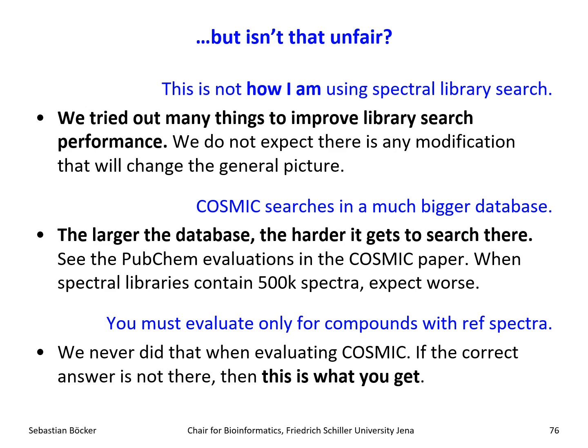I mean, obviously now the total number of compounds that you could assign goes up to 100%, but there are so many more candidates. It gets so much harder to find the correct one that CSI performance simply gets much worse, and Cosmic cannot really do something. It also gets harder for Cosmic to see which ones are correct and incorrect. So if spectral libraries get larger, I think that the separation through the library hit score will get worse for library search as well.